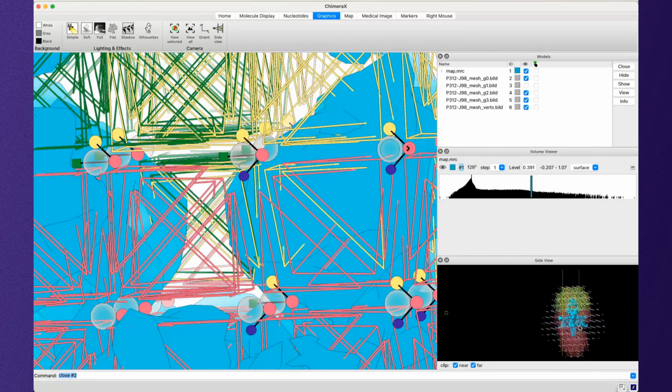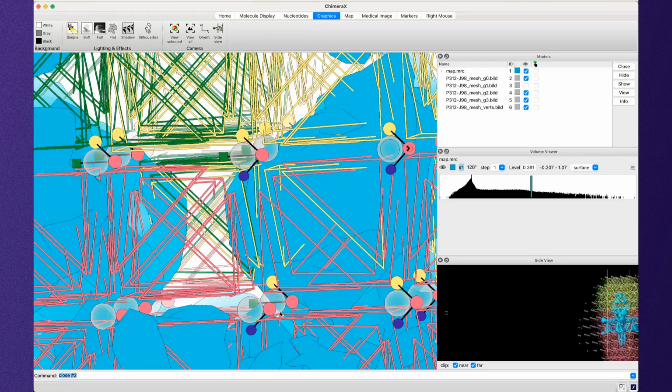And that makes sense, because right here is where we start to say, this is too close to the core of the ion channel. We want this part to be fused to the ion channel, which means any tetras in here that belong to the fab and to the ion channel are going to get assigned to the ion channel, and then we're going to fuse these vertices together so that they can't move independently.